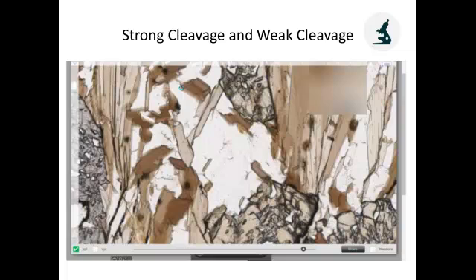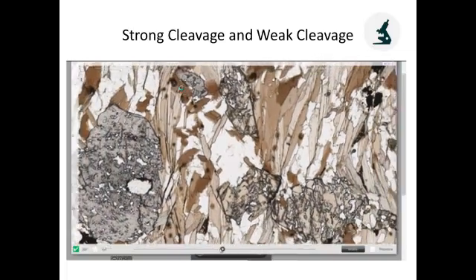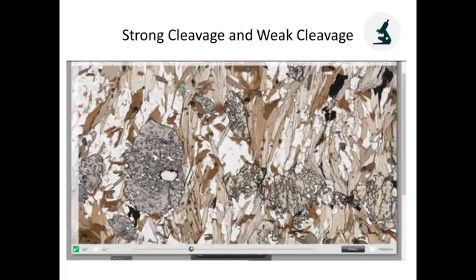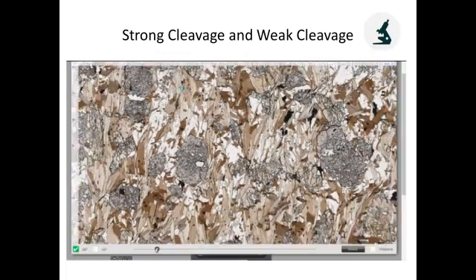Now this white mineral in the middle, that's quartz, that has no cleavage to speak of. It has a slight mottling colour in thin section, but you'll never see cleavage in quartz. Also in this thin section, in the view here to the left, you've got a garnet, and to the right a staurolite. They're full of inclusions, so it's not easy to see, but they're fractured. They're not cleaved. Again, characteristic of these minerals.